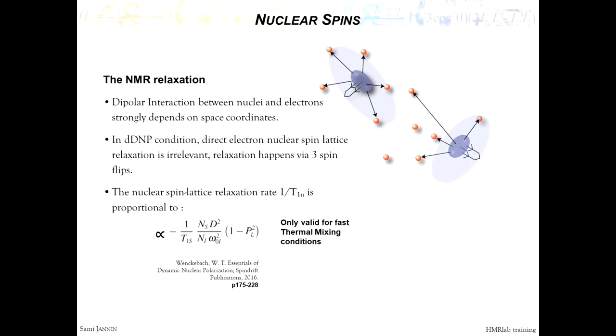Yeah. So if it's an hour for proton, according to the formula, it might be at least 16 hours for carbon, omega square.